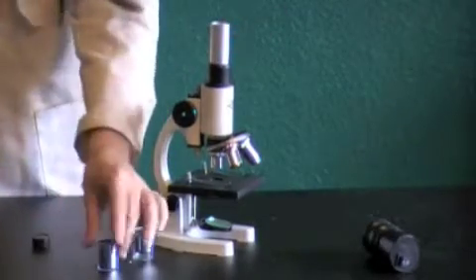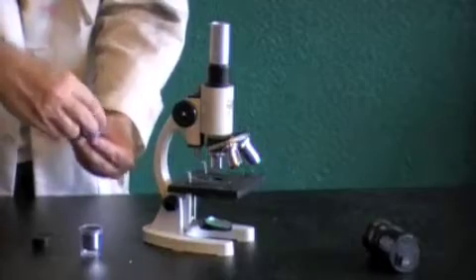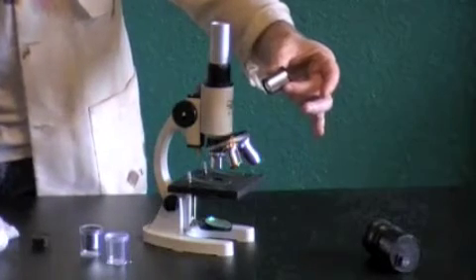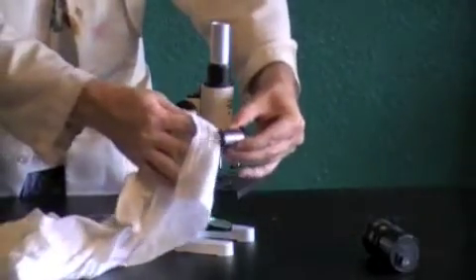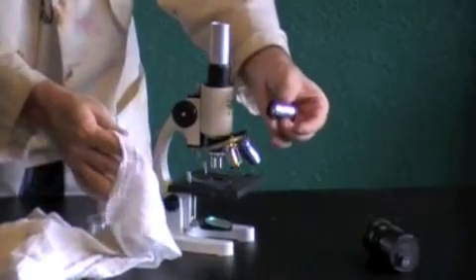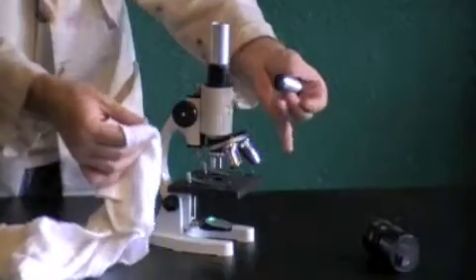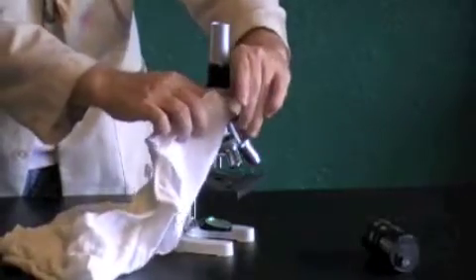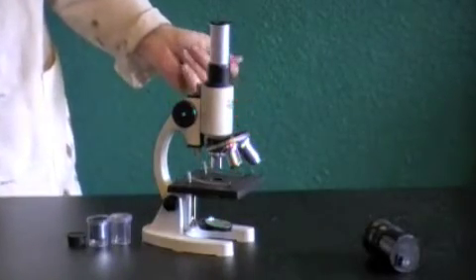Now, take off the cap at the top. You have two different ocular lenses. These are the ones that are the eyepiece. If this is not clean for some reason, do not use paper towels or napkins or anything that's a paper product on it. What you're going to want to use is a piece of clean cotton that you can wipe your lenses with. If for some reason the lens does not come clean by just wiping it with the cotton, then put a little bit of alcohol onto the cloth, not onto the lens. Wet the cloth with a little bit of alcohol, and then wipe it and let the alcohol dry off of it, and then put it in your microscope. That will make it nice and clean then.